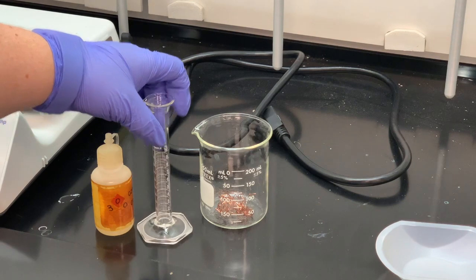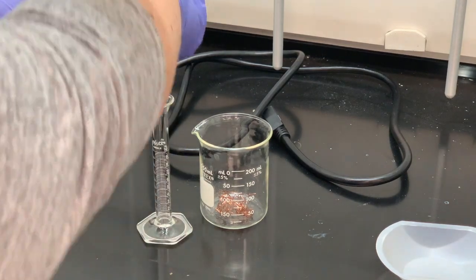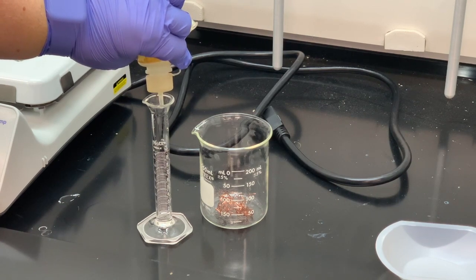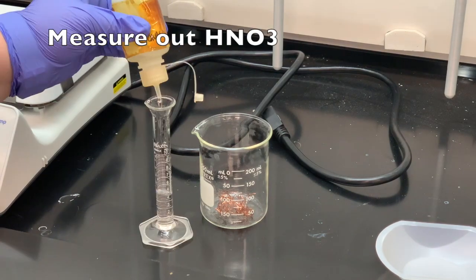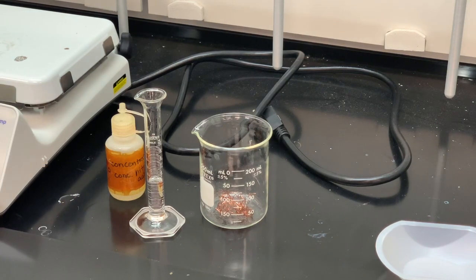I'm going to measure out between 4 and 5 milliliters of nitric acid. This is concentrated acid. So I have gloves on, I'm working in the hood. I also have goggles on to keep myself safe. Remember that when you are measuring volumes, you always want to use a graduated cylinder. So here I'm just going to measure somewhere between 4 and 5 milliliters. There's not an exact volume to measure this time. Okay, I have about 5 milliliters of concentrated nitric acid in my graduated cylinder.